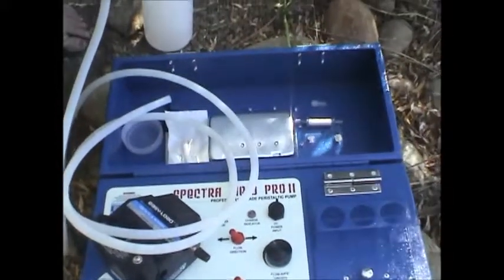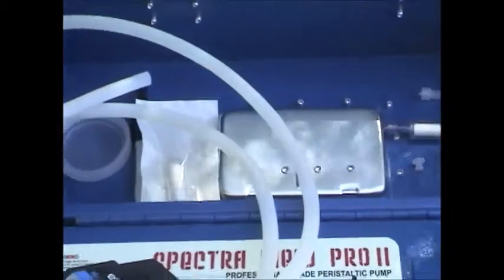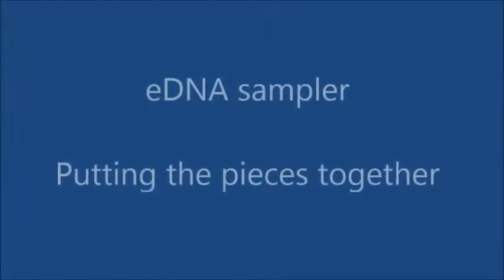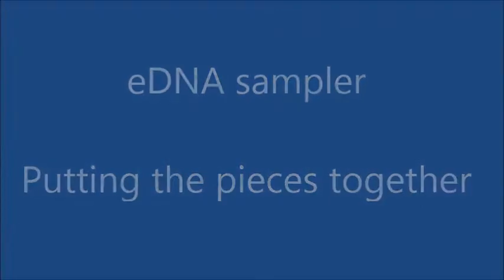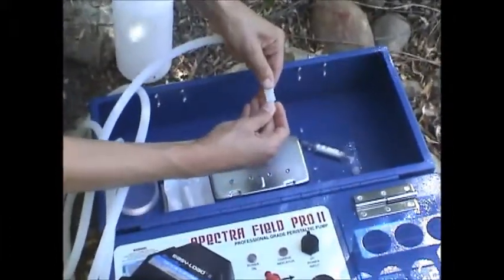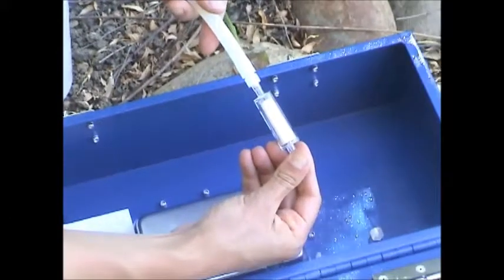The top of the lid has the hose adapter, the Sterivex Millipore filter, and a couple of end caps. Columns usually come in a sterile pack. Now we need to attach the column to the line that's going to be filtering water. Take the hose adapter, insert it into the end of the tube, then screw in the column itself, hand tight.